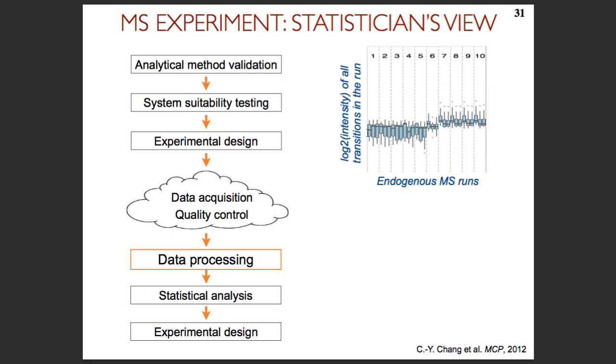So these are box plots. The box contains 50% of the data, right? The line in the middle is the median. And so we see now that the overall signal across all the quantified analytes essentially went up as the time progressed. Now, this experiment was randomized. We just arranged the runs in a way that follows the time. And so the question is: is this change an artifact of data collection, or is it the actual biology?